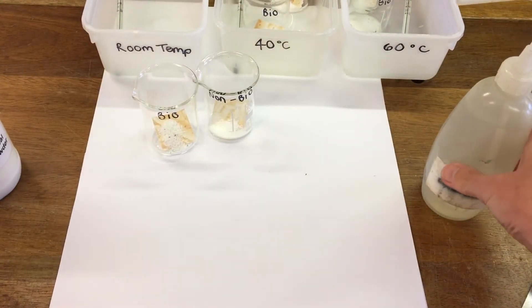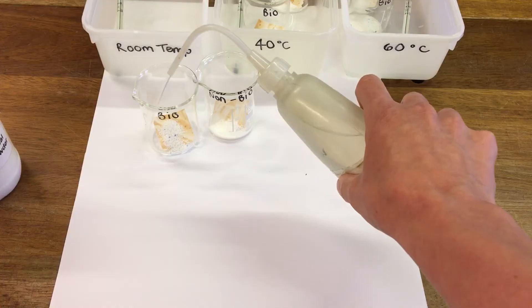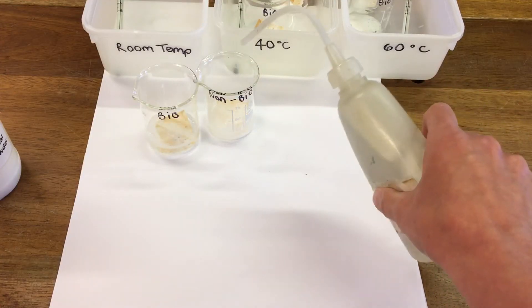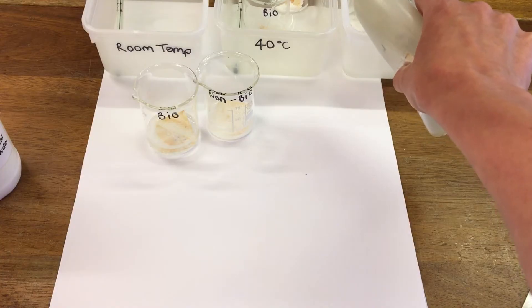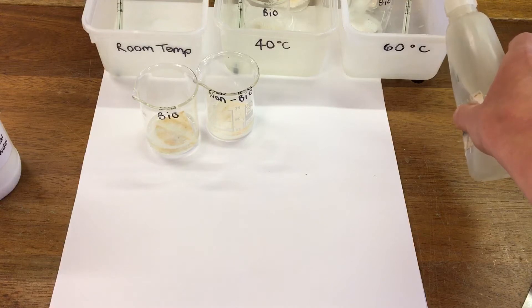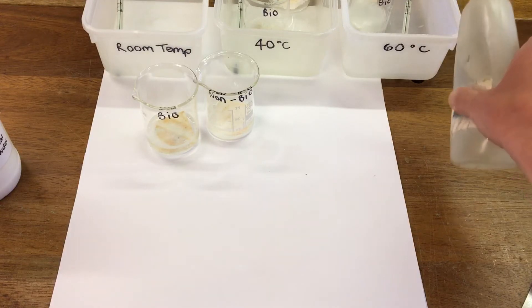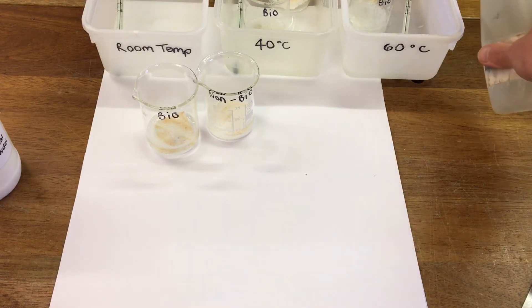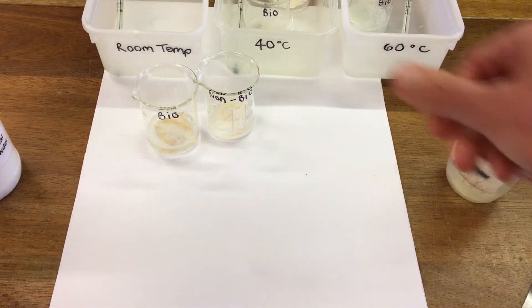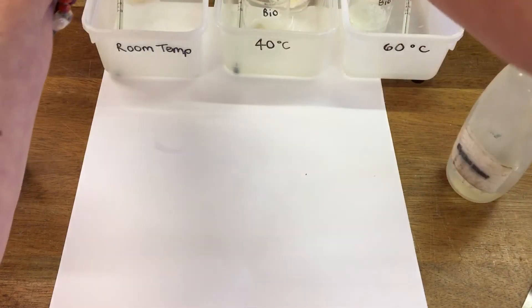As well as the washing powders, in each beaker I'm going to add some water. We're then going to test each cloth at different temperatures and see how the temperature affects the washing powder. I'm going to pop these two in here.